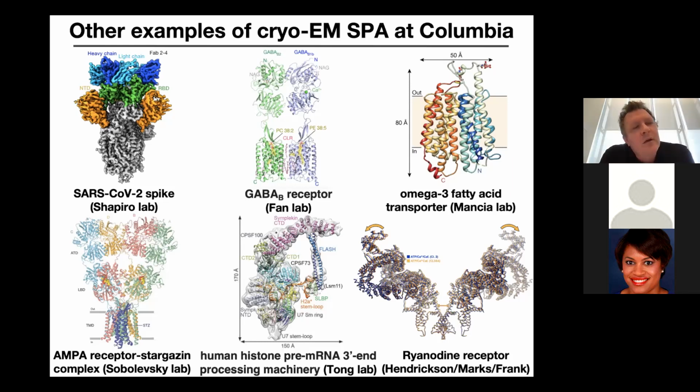Right. So I think the Volta phase plate came out around 2014, 2015. And initially there was a lot of excitement because you do get higher contrast from these phase plate images. The trouble with using a material phase plate is that it really is just a piece of carbon that you insert post-specimen, and then you heat it up slightly so that you get a kind of electron cloud emanating from that. And that is what is deflecting your electron beam and causing the phase shift.